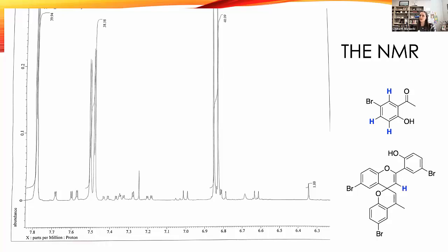So students then grapple with, okay, I have an intense color. I clearly have a small amount of material, but now I can actually tell how much I have. And then come up with further experiments, maybe longer time, maybe different conditions, right? What could we do to improve it? As a dye chemist, the ability to use NMR in this way to both prove that a product has been formed, right? But also to suggest that this reaction isn't very far, right?